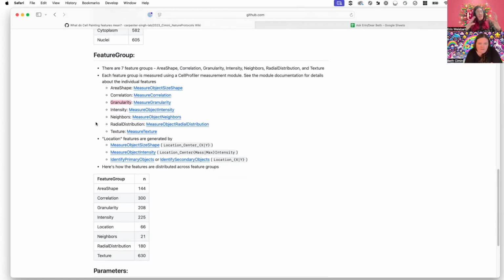So it's conceptually similar to texture, but mathematically quite different. We get the biologist hand waving, oh, it's looking at texture, but in terms of what that means, there can be a bit of a disconnect.